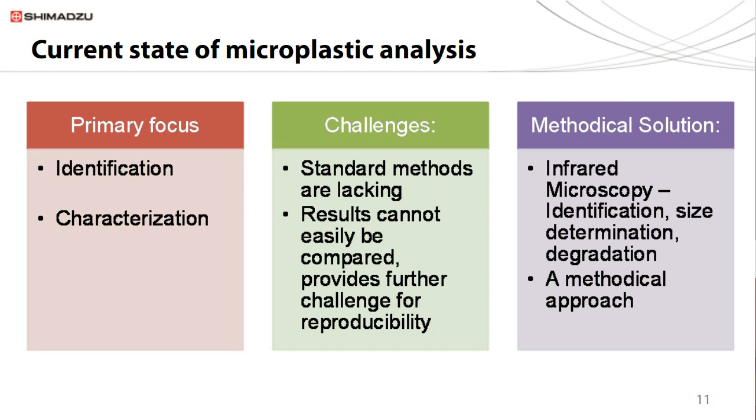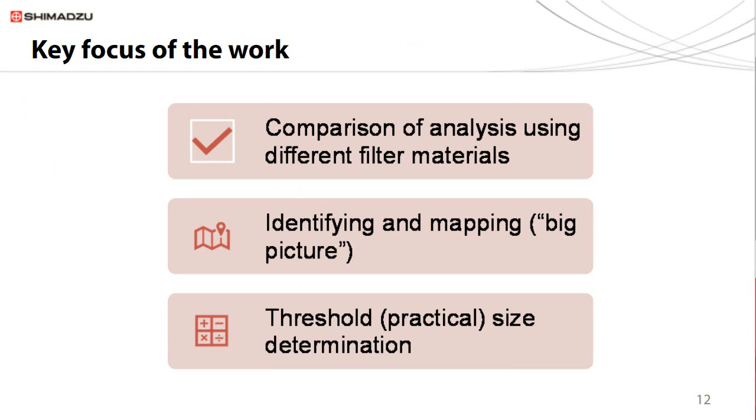In this work, we conducted a methodical evaluation of significant operational parameters of infrared microscopy for accurately determining the size of microplastics, with the overarching goal of outlining performance parameters that will help in the standardization of the analysis. The aim of our work was to solve simple problems that are often overlooked but are significant to help standardize the analysis of microplastics.